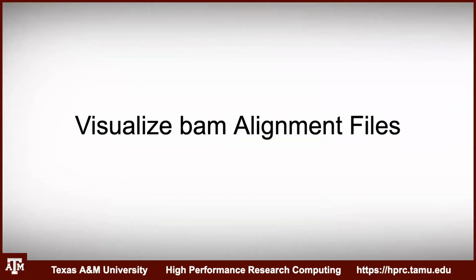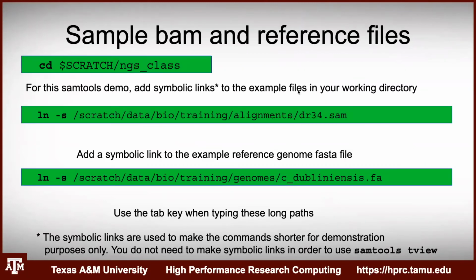All right, now we're going to go through some exercises on visualizing BAM alignment files. So make sure you're in your NGS class directory if you're able to set that up. And you're going to create symbolic links to the example files in your working directory.